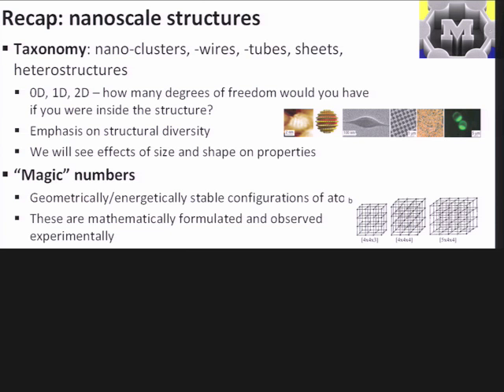And we saw how these are actually observed, and this was a schematic from experiments with titanium nitride, where they saw peaks at each of these magic number clusters corresponding exactly to the numbers here. And we also know that C60 is an example of a magic number cluster.